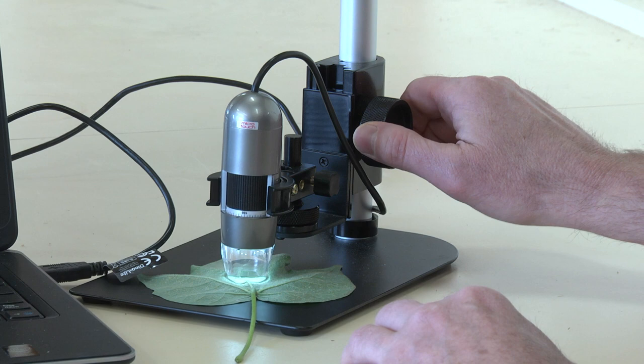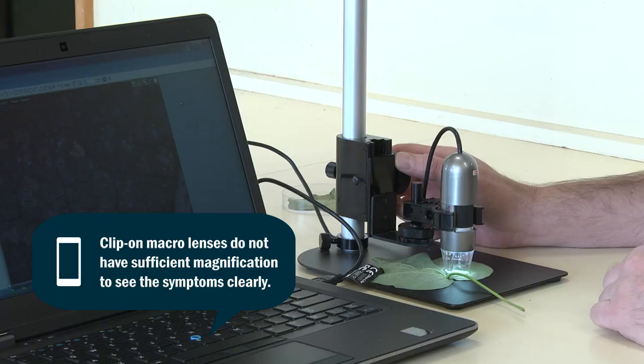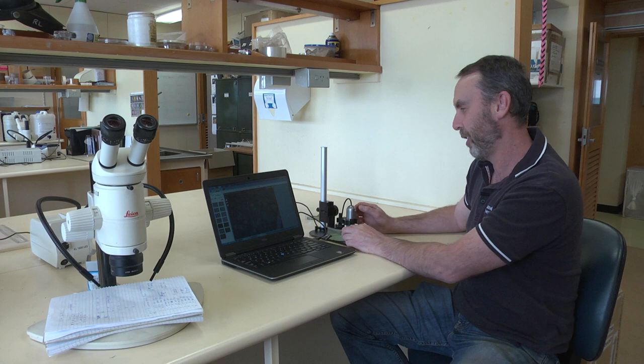We've got the stand here that helps keep the Dynolite nice and steady, and you can use this controller here to focus the image. The Dynolite is powered by USB so it will plug into the laptop.